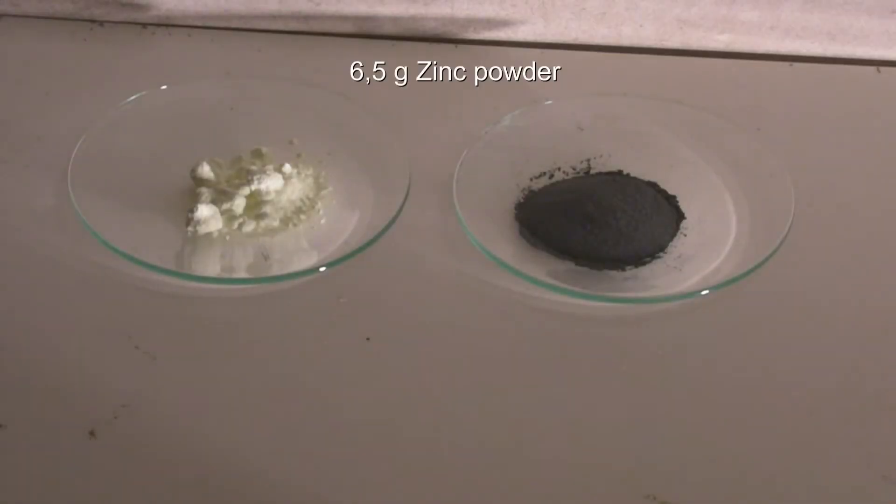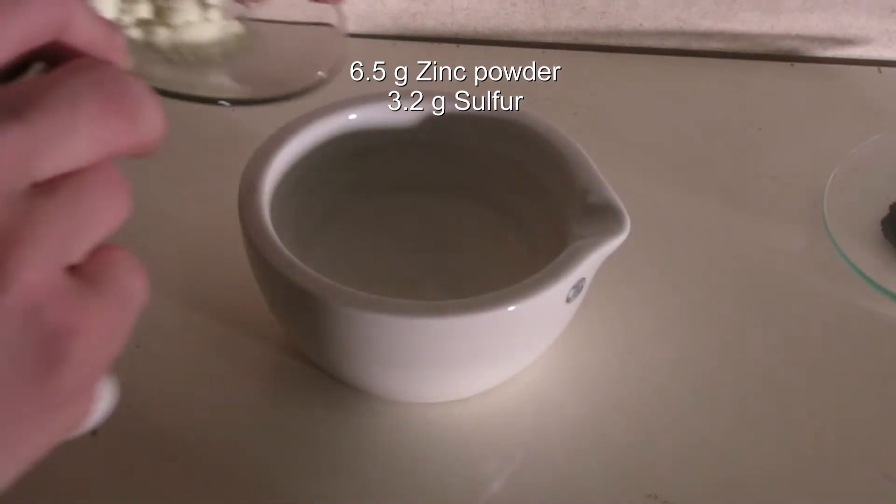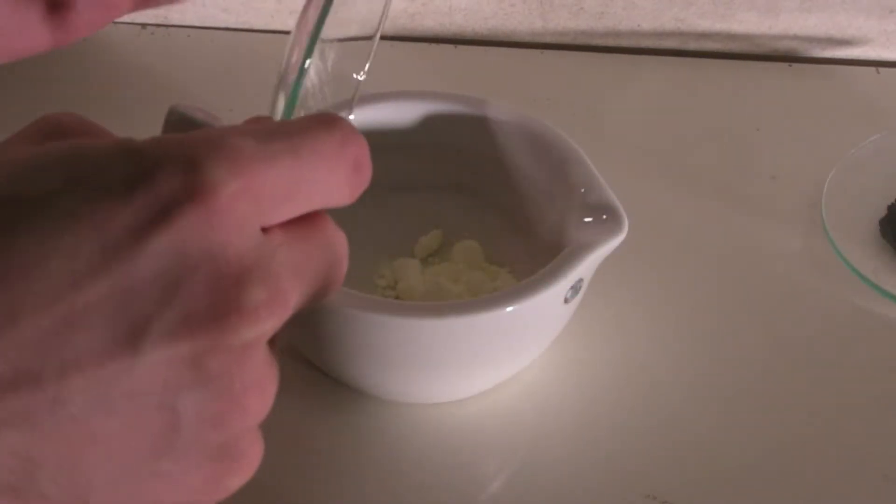For this experiment, 6.5 grams of zinc powder and 3.2 grams of sulfur are used. The amount is enough to do the experiment two times. The sulfur is ground so it can be easily mixed with the zinc powder.